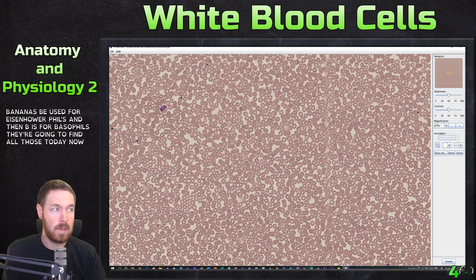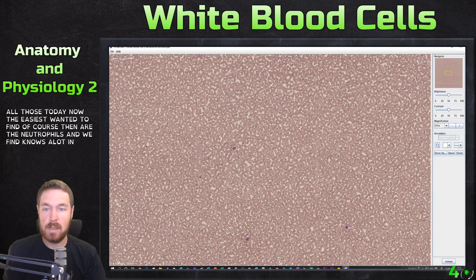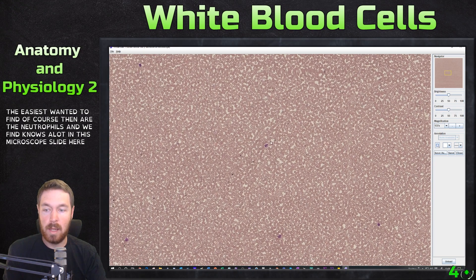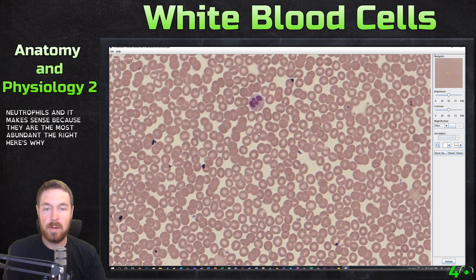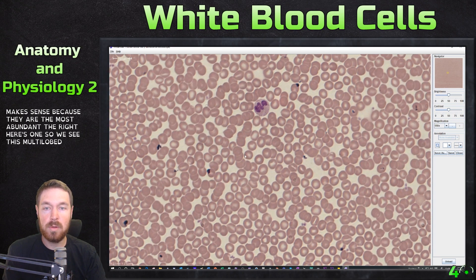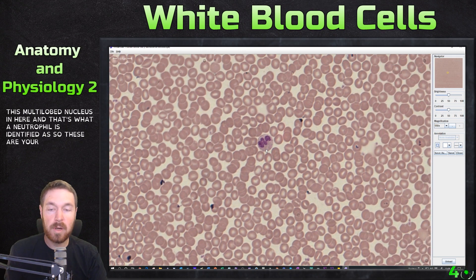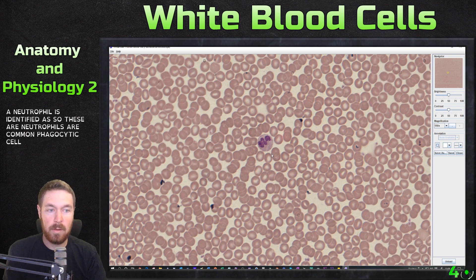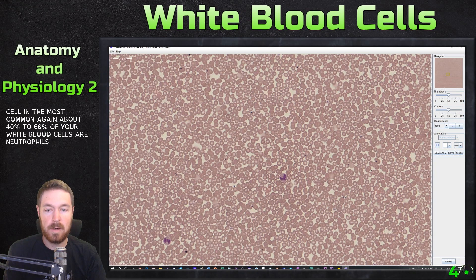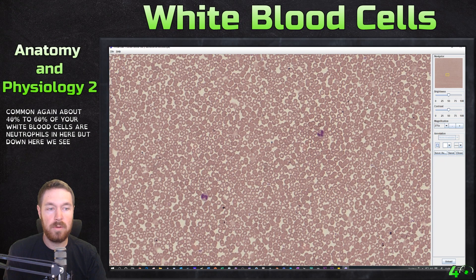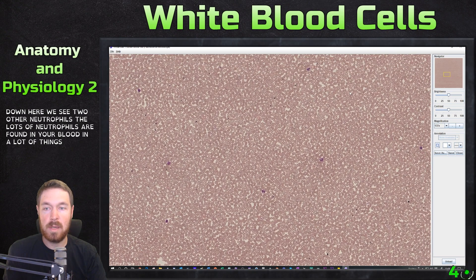The easiest ones to find are neutrophils — a lot of the purple pigments on this slide are neutrophils, which makes sense because they are the most abundant. Right here we see this multi-lobed nucleus, which is how a neutrophil is identified. They are a common phagocytic cell, making up about 40% to 60% of your white blood cells.